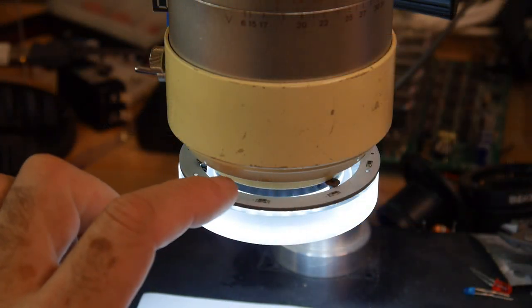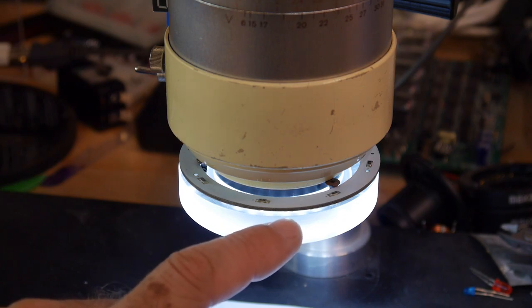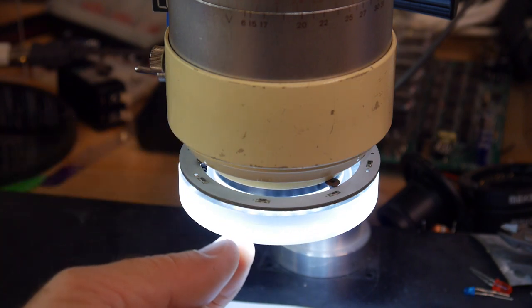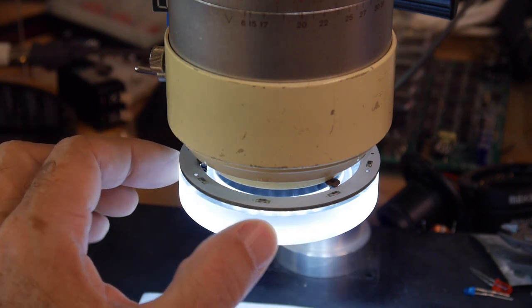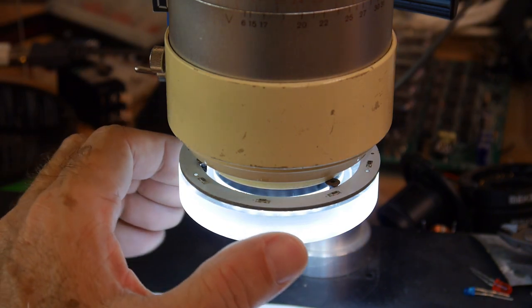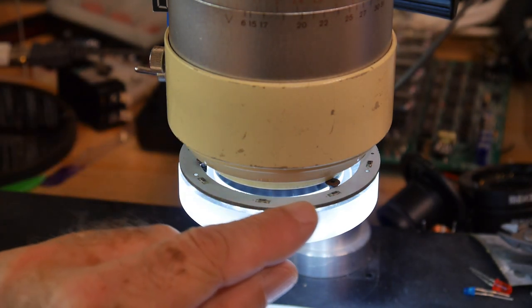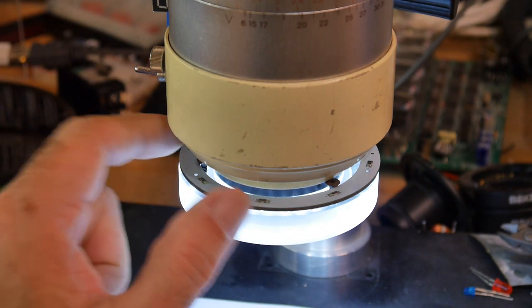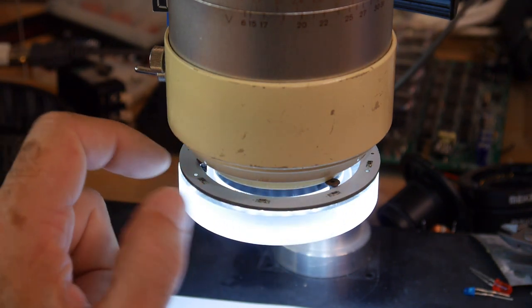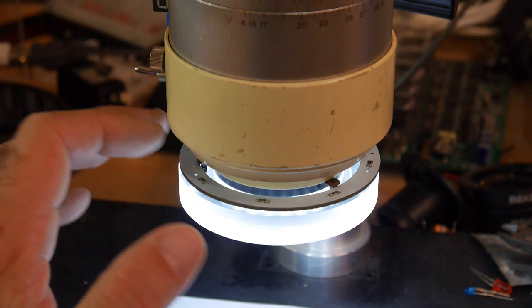You need some way of mounting the LED. I have a piece of Lexan here that I turned on my lathe. It's just a ring that fits the lens on this microscope — a snug press fit on the lens. And then the little angel eye PC board just sets on top of it, held on with a couple of screws. That gives a nice mounting system.